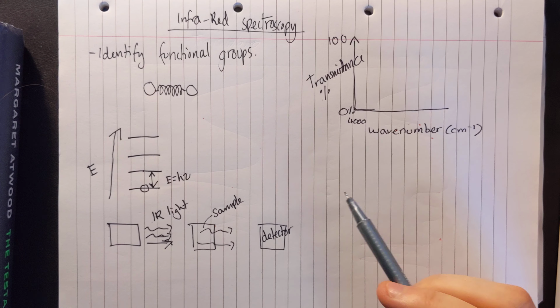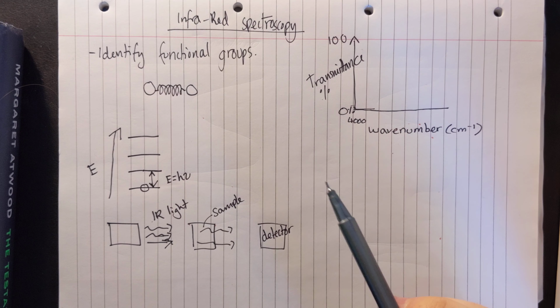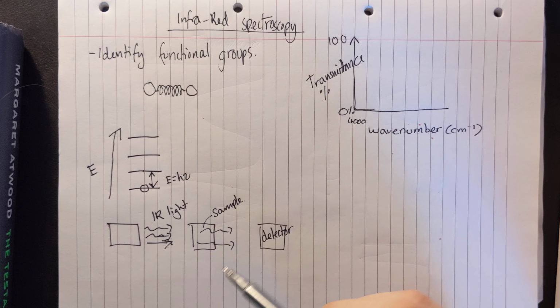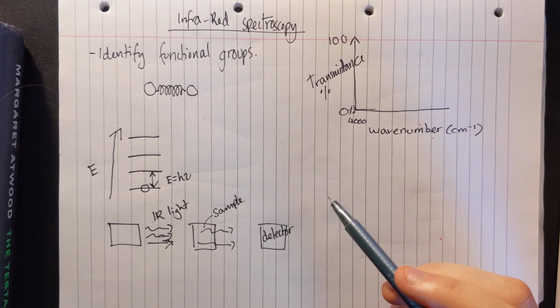There are about 15 or so of them on there, and most of them are useless, and they just get in the way of you being able to effectively interpret infrared spectra. Realistically, you only need about 4, maybe 5 things that you can identify from an infrared spectrum. And frankly, you shouldn't really need the data table at all.